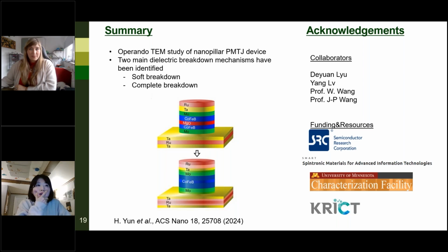Oh, yeah. So I got the thickness of the TEM samples using the EELS log-ratio method. And I got the EELS data from the silicon substrate just beneath the MTJ region of interest. That is because I didn't want to put too much electron beam on the main region, and because the silicon substrate has a well-known mean free path, which is used in the EELS log-ratio method.